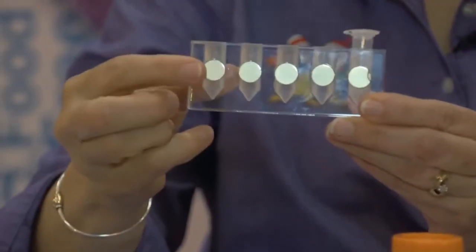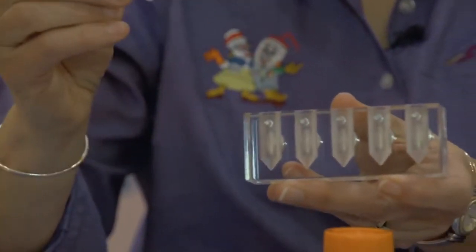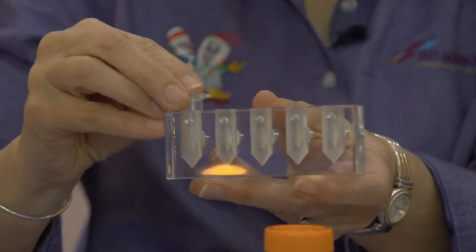The 1.5 and 2ml rack does not have individual wells, but rather has two sleeves which can be removed that have five wells each. Again, each one of these wells has a magnet on one side and a spring plunger on the other side. I have flexibility on where my tube is in the well, and hence where my beads will collect on the wall of the tube. Mixing can be achieved simply by turning the tube in the well.